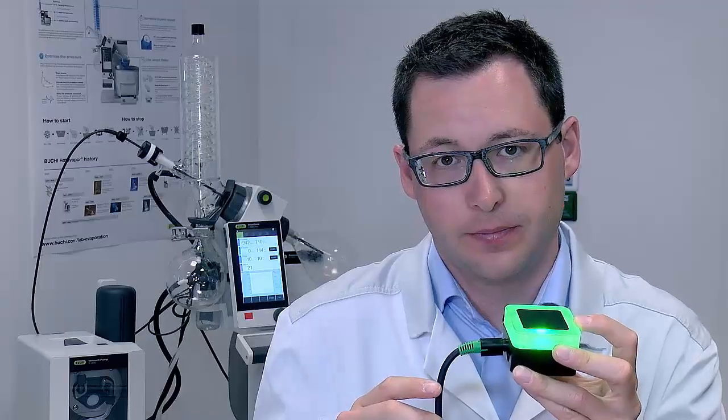This light is compatible with the R300, R220 Pro, and the LiO vapor. The nice thing is you can see it from 360 degrees. You can mount it on the rotary evaporator or stick it to a fume hood, so you can really see it throughout the lab and see what's happening.